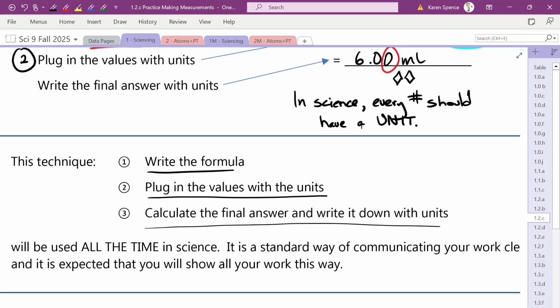Okay? And technically, I should be the one doing this, but if you want to, I'm not going to stop you. Because as long as you're not touching any of the glass with your fingers, this is okay. All right? That's our very first lab safety thing.